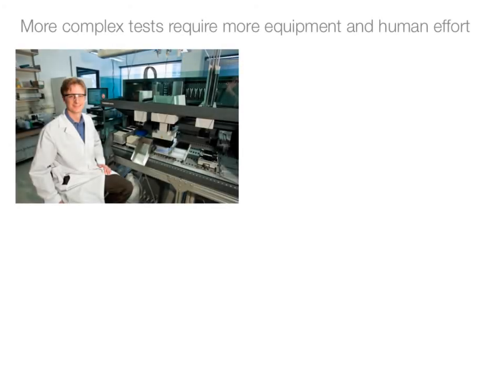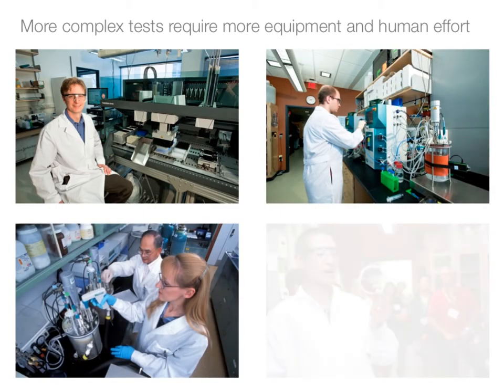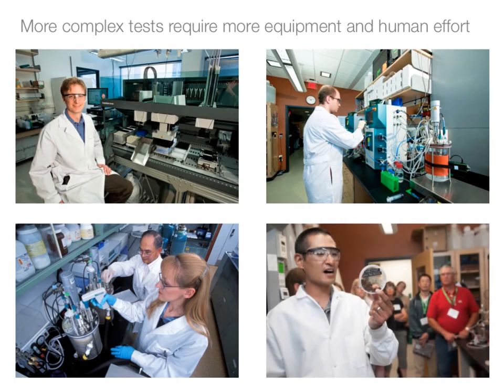The setup for continuous tests is more complex than for batch tests. It also requires more equipment and human effort. This in turn creates cost and limits the number of tests that can be performed simultaneously.